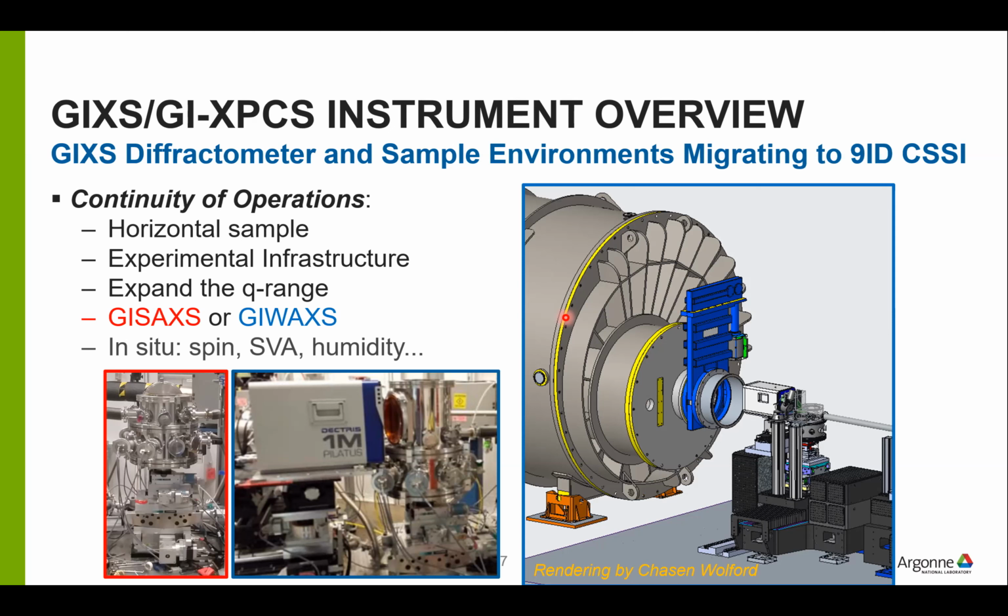I just want to know whether they're only good for slow change, for example your heat up, because heat up is usually a slow change, or whether they can also adapt to any sudden change. So, 10 hertz maybe. Right. I guess with the thermal stages that we have now, mostly we're relying on a Linkam stage. That's from about liquid nitrogen temperatures to about 300 C, and that one heats at up to about 20 degrees per minute. So per minute, yeah, we think we could potentially keep up with that. Okay, good.